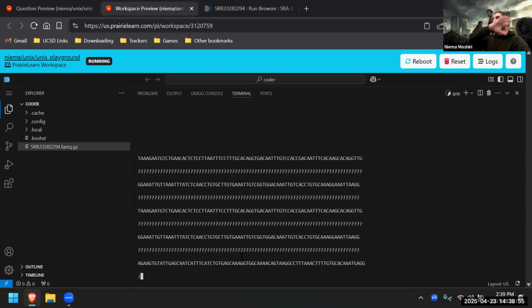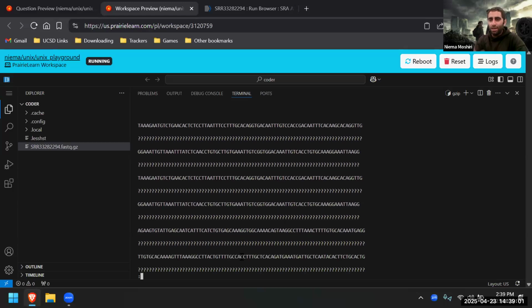We mentioned back in, I forgot, was it week 1 or week 2, that we talked about trimming. Normally you trim the low quality bases from your reads. Today, we're not going to do that because it looks like these are pre-trimmed. But in theory, if they weren't trimmed already, we would use FastP or something.